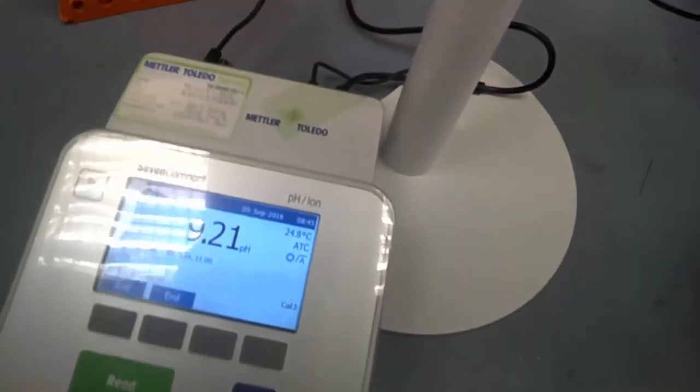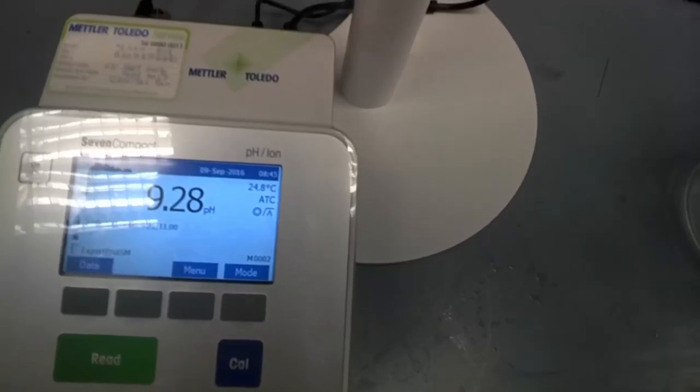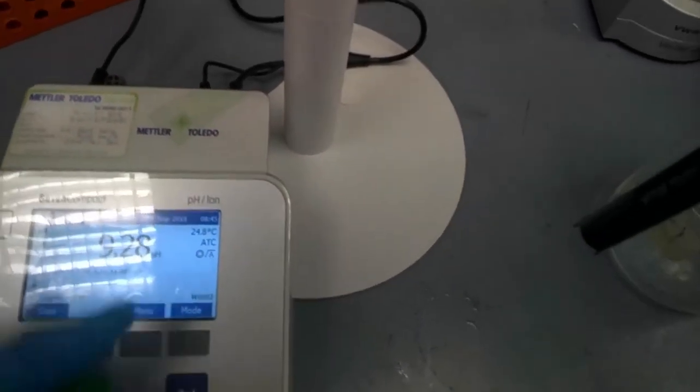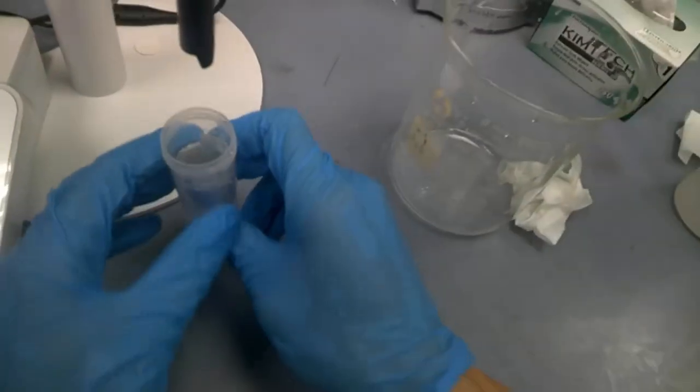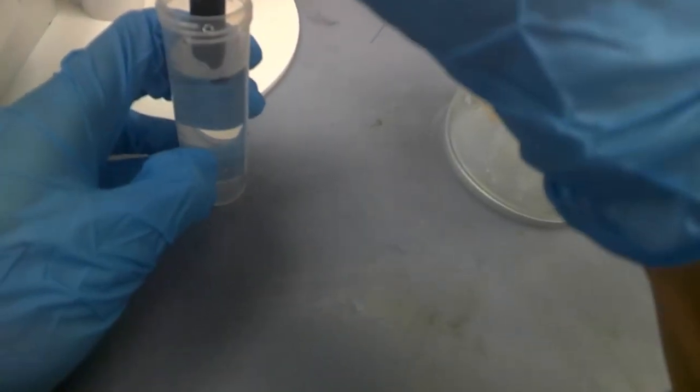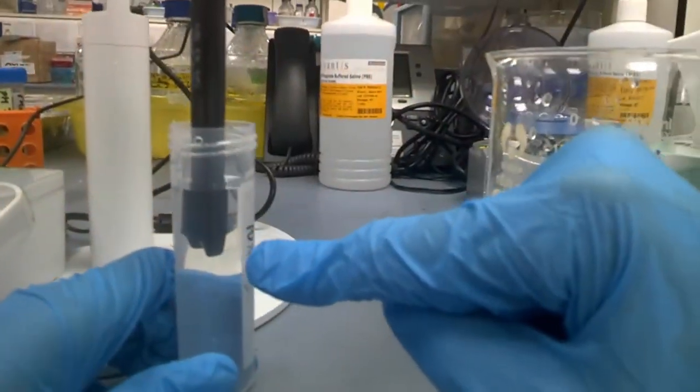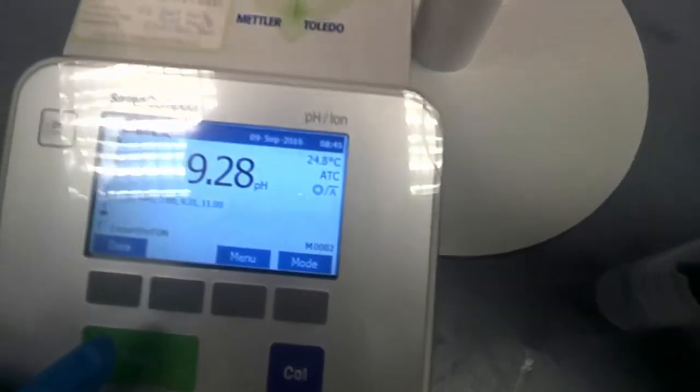So this is all done. We click exit. Again, note the temperature change. Just now it was 24.9. Now it's 24.8. This is my unknown solution. I'm going to place my pH probe inside there. Make sure the liquid doesn't spill over. It doesn't flow over. And then, once I'm ready, I'll click Read. This button here in green. Read.